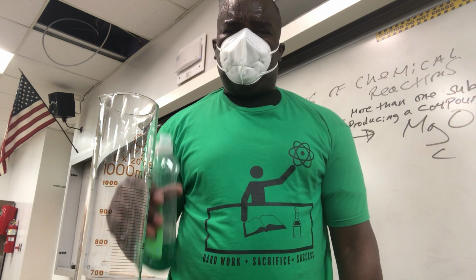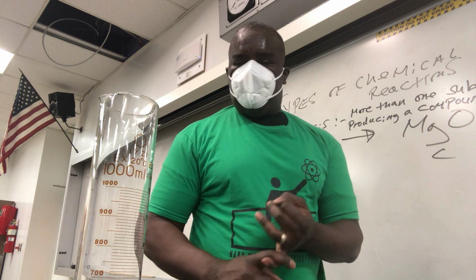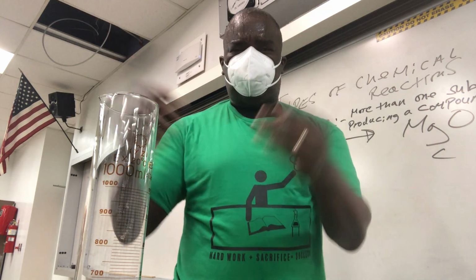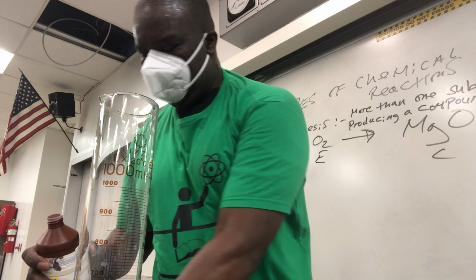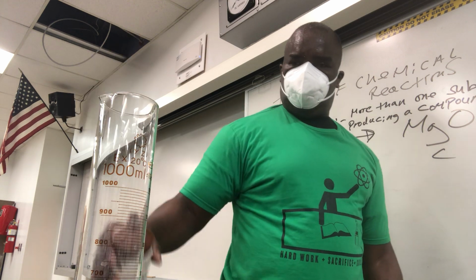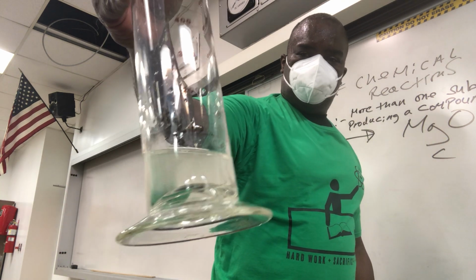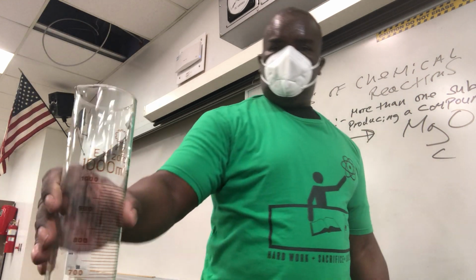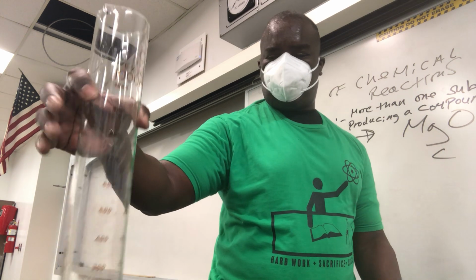Now, the reason I'm doing that is what's going to be given off is water and oxygen. The dish soap is going to trap the oxygen while it's being given off, and hopefully we see a nice foamy evolution coming out right here, okay? No problem. So, here we go. See that? That's my hydrogen peroxide in there. Now we don't want to forget to put my dish soap in. Good amount. Bam. I get the swirl. My students from last term, you saw me do this in class. I love this reaction too.